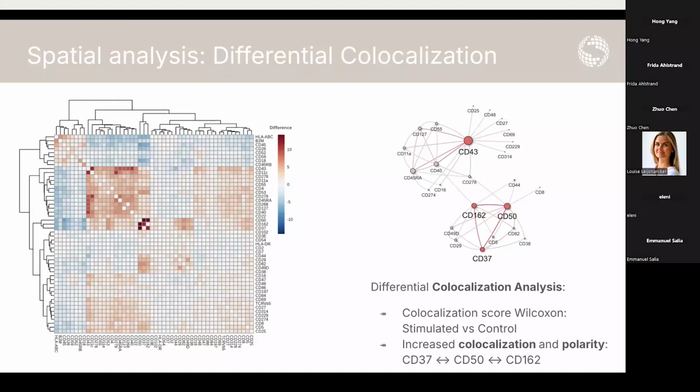And visualizing colocalization data with a volcano plot could be difficult to assimilate. After all, with the colocalization data, we're getting thousands and thousands of different possible colocalization pairs of proteins. So having a different way of visualizing that could be helpful. One way to do that would be by using a heat map.